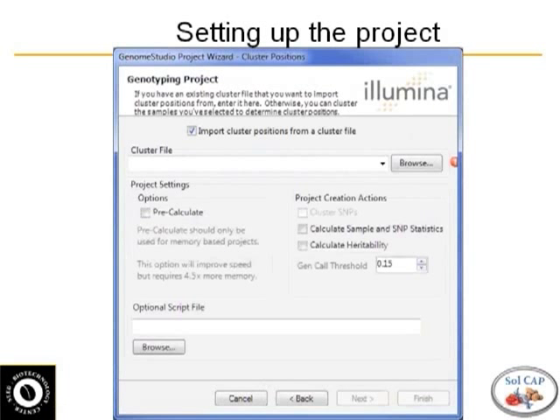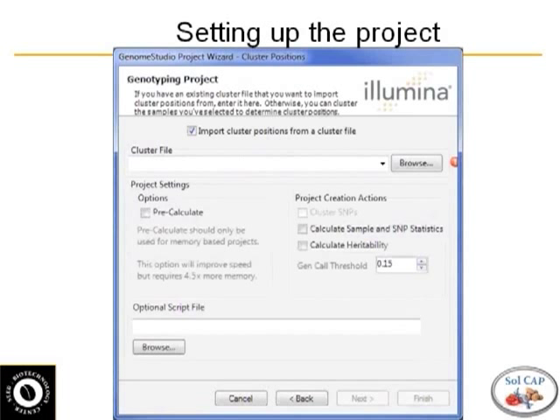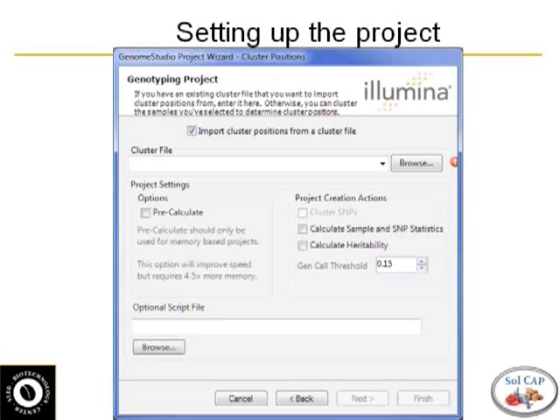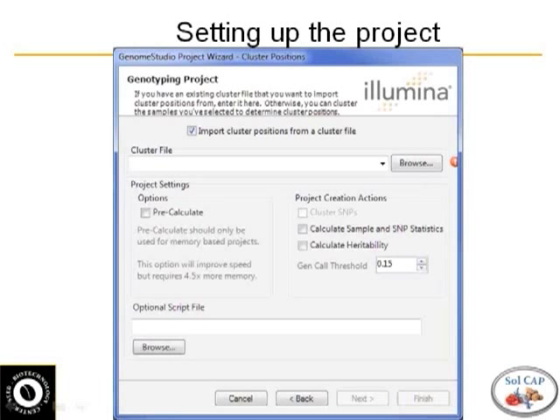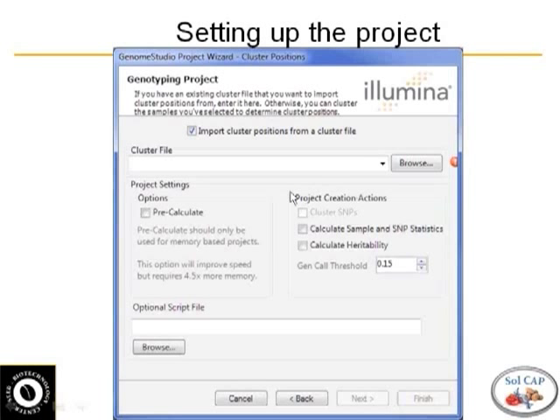The next window that you open in Genome Studio, and Genome Studio is a fairly simple program that downloads, it's auto-wizard, it's fairly simple to get at. So the next thing you'll do, so you've loaded, it tells you where to find the data and next one you're going to see is a window to say, so what kind of things do you want to look at.